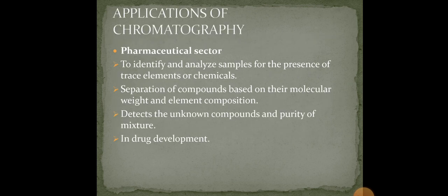Then, applications of chromatography. It can be applied in the pharmaceutical sector to identify and analyze a sample for the presence of trace elements or chemicals. It separates components based on their molecular weight and element composition. It detects unknown components and the purity of a mixture. It's used in drug development.